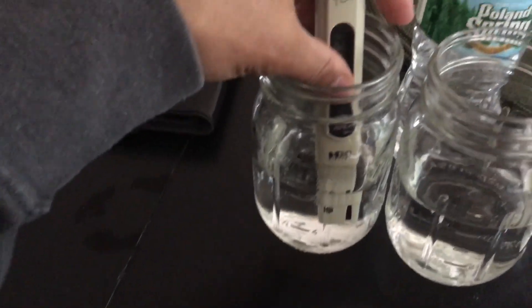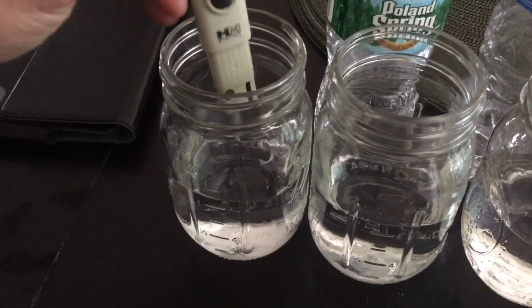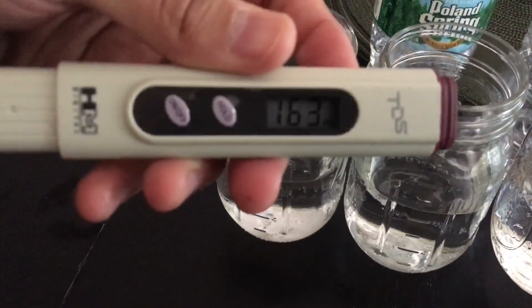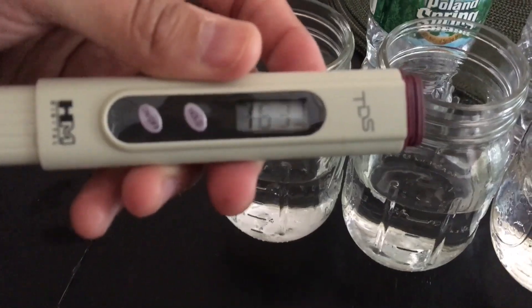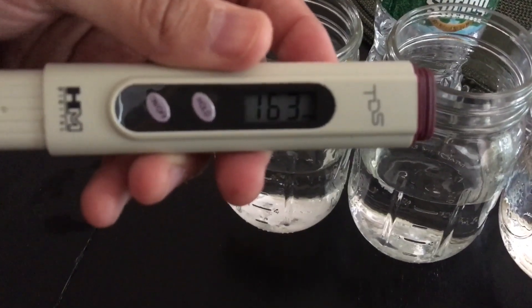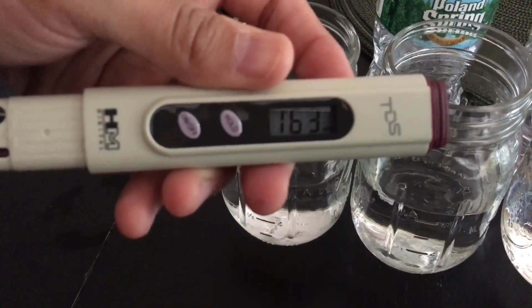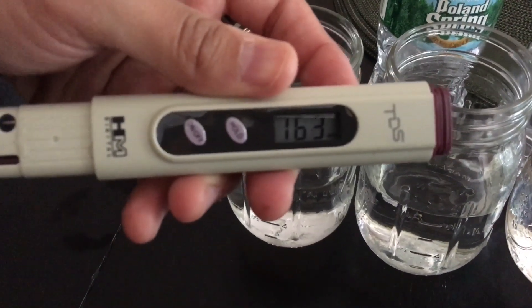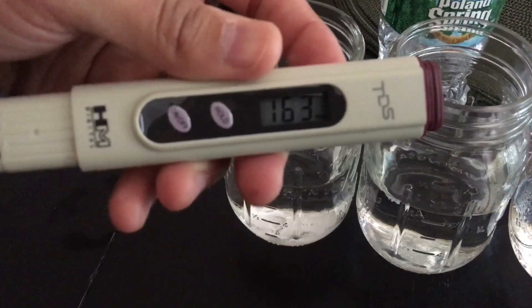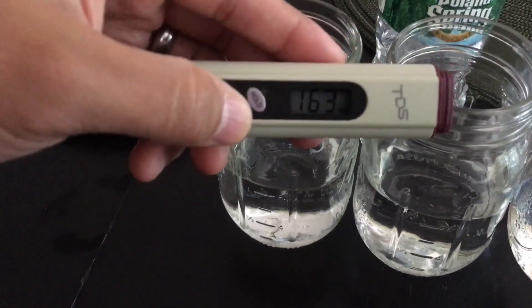We go ahead and put it in again for a couple of seconds. When you press the hold button, you'll see the display start flashing — that's how you know it worked correctly. My municipal water has a reading of 163 parts per million (ppm), which means there are definitely some organics or solids in there that you'll want to filter out. For my nano project, since I'm only going to have a 13.5-gallon tank, I'm looking to first test water from my local fish store and then eventually buy an RO filter. But there you go — 163 ppm.